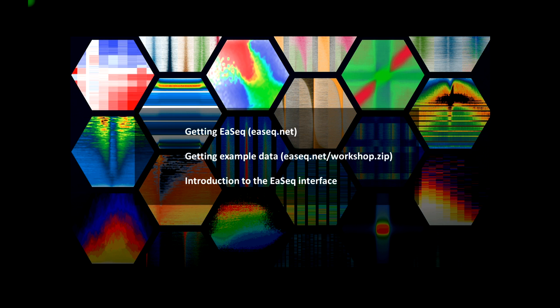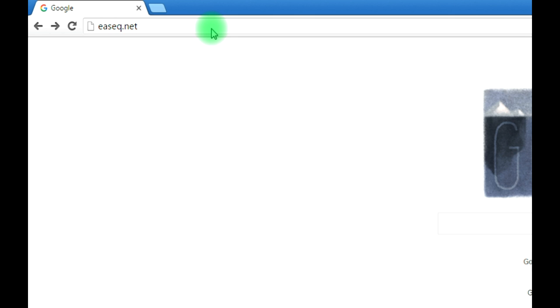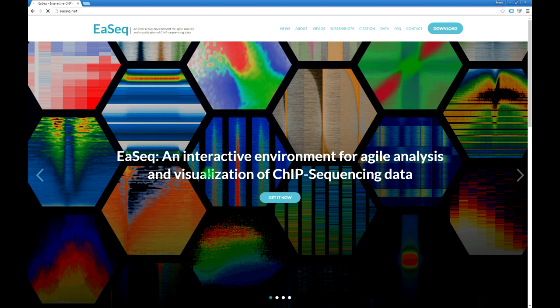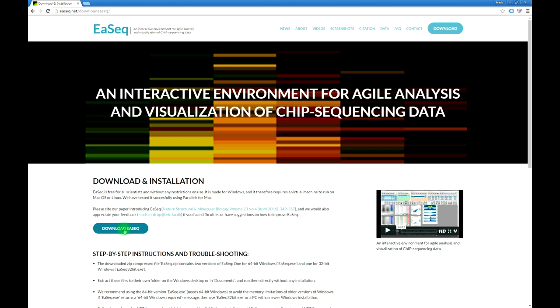First, we will need to open a web browser. Then go to the address and type EASEQ — E-A-S-E-Q dot net. That will take us to the web page, and on the front page there is a 'Get It Now' link. If you click on that, then you have a link that allows you to download the most recent version of EASEQ.